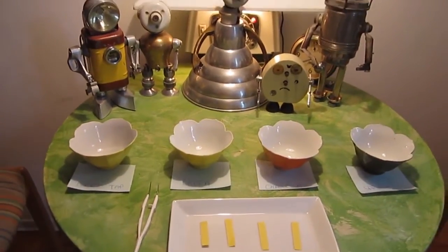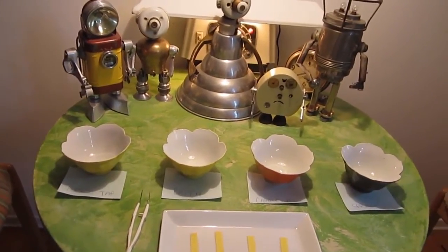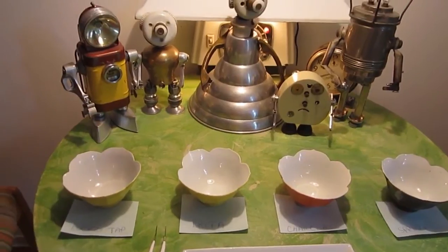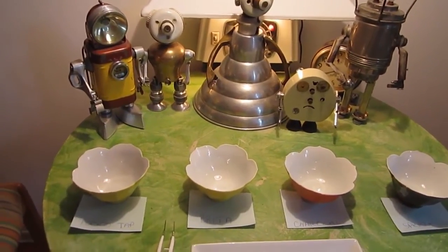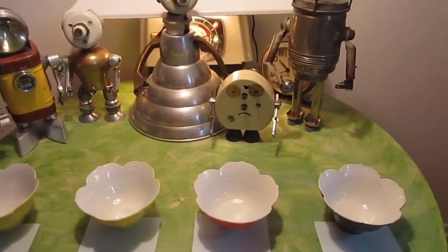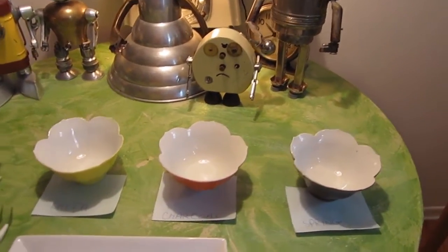We're interested in finding out the pH value of different sorts of water around Toronto. We're going to test Brita, tap water from Toronto, charcoal water, and spring water from a spring just north of Toronto.